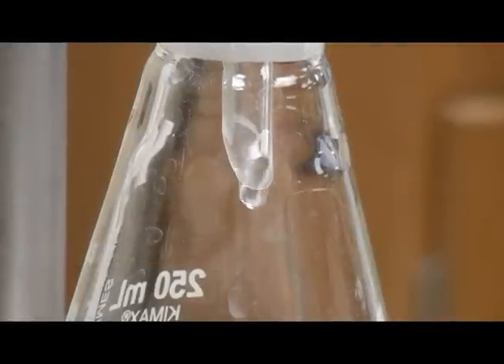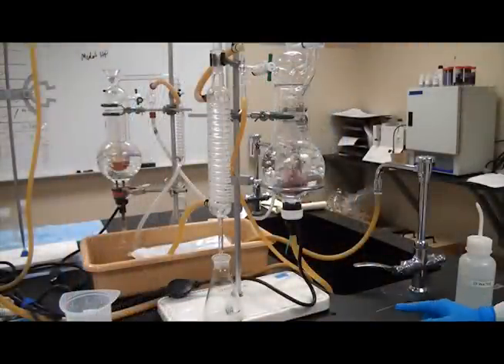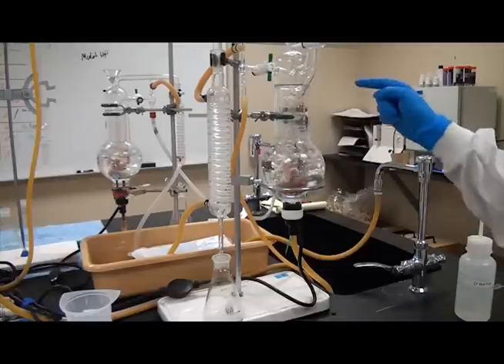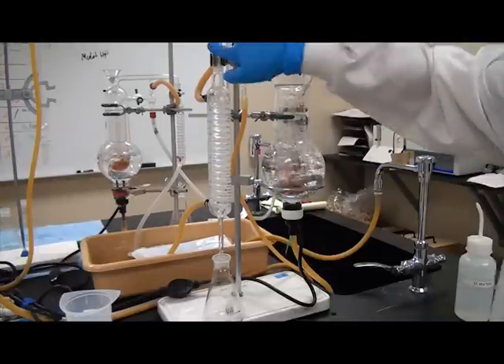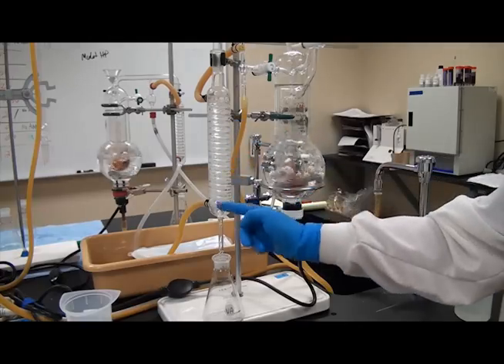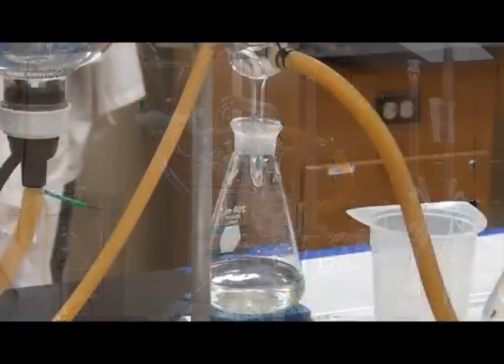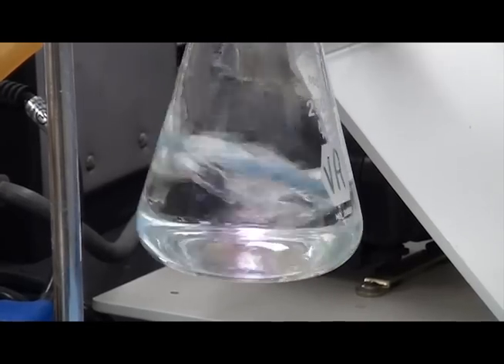The cash-still method is often used to measure the VA levels of a wine. The cash-still consists of a complex apparatus of glassware with a heating element on the bottom and a condenser on the side. Acetic acid and other volatile compounds are distilled out of a degassed wine sample, and the distillate is titrated with a 0.02 normalized sodium hydroxide solution.